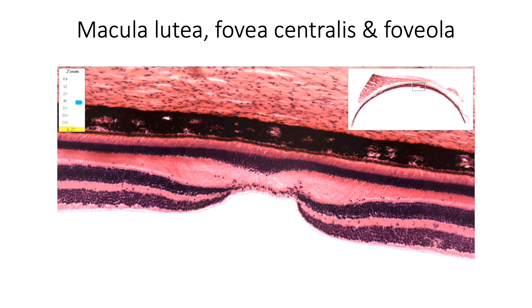At the fovea centralis and its central foveola, only the outer five layers of retina are present — the inner five layers are pushed aside. The photoreceptor cells here are exclusively cones. This area is devoid of any retinal blood vessel, which makes it easier to identify with an ophthalmoscope. The surrounding macula shows all ten layers of retina, with rods beginning to appear at its periphery. A distinct feature of the macular region is that ganglion cells are about eight to ten cells deep, as against the single layer of ganglion cells found elsewhere.